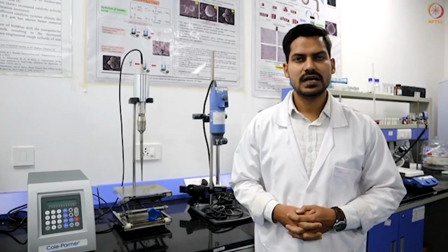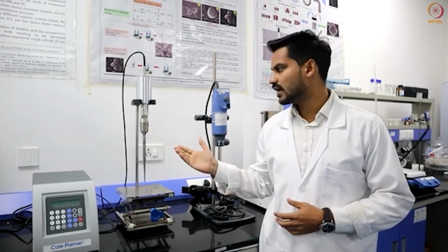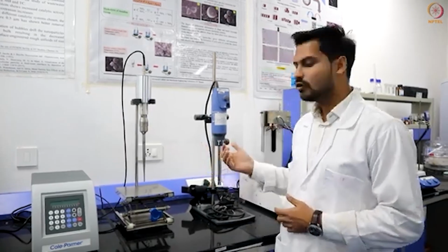Welcome back. My name is Vishal Singh Pawak. I am a PhD student in the Department of Chemical Engineering, working under the supervision of Dr. Manigandan sir. Today, I will demonstrate emulsification using several emulsifying devices. Initially, I will explain the working principle of two devices. One is the prototype sonicator that we have, and another one is the homogenizer. Then we will proceed with the demonstration part.